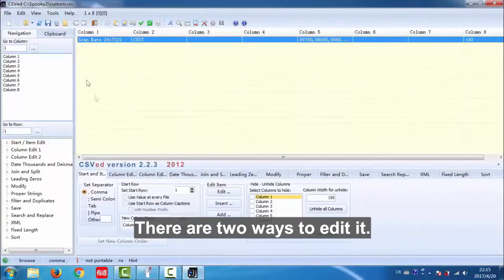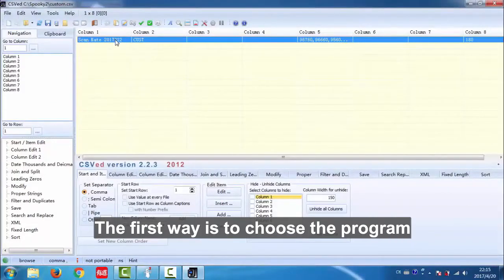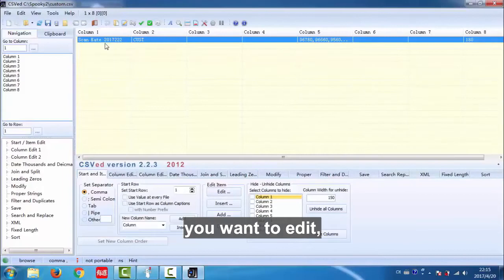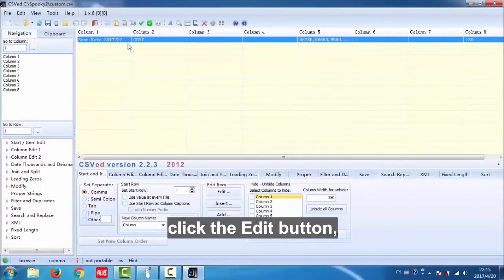There are two ways to edit it. The first way is to choose the program you want to edit, click the edit button.